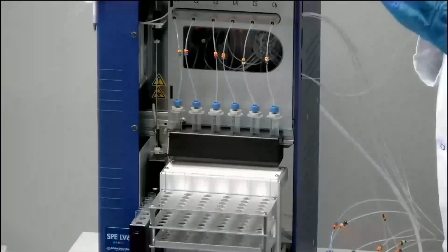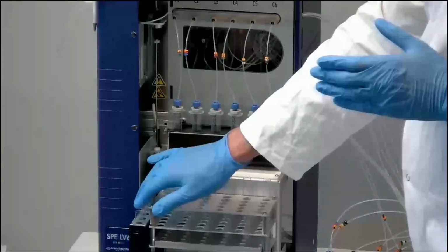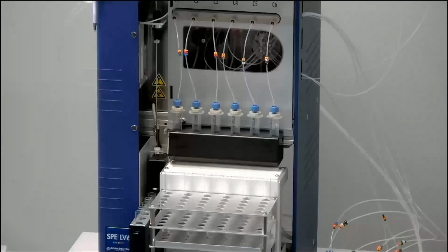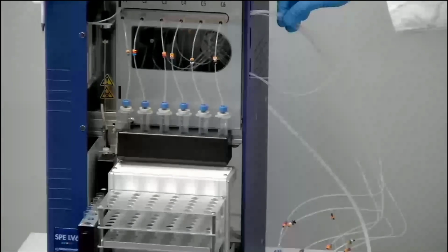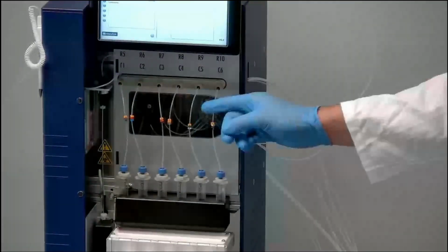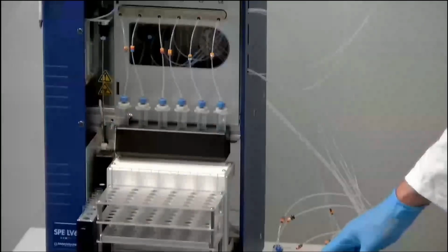As I said, we can load a sample volume of up to 5 liters. With the autosampler, we can't put a bottle of 5 liters. So to be sure that our system is available for environmental analysis, especially for water analysis, we have another option, the large volume mode on the software. When we use the large volume mode, we will use these tubings. We have 6 different tubings linked to each position. That's why we have different line indications. And you put your sample just here.